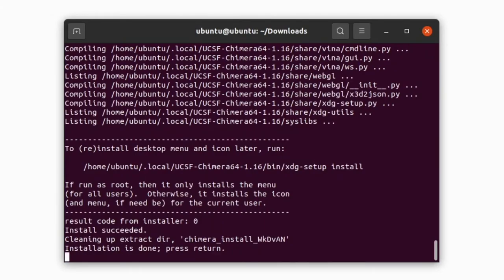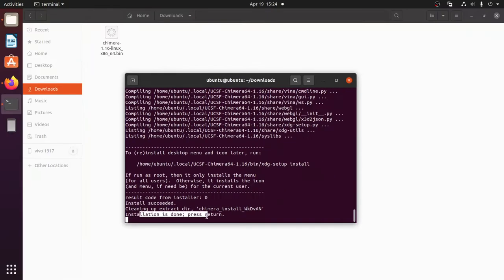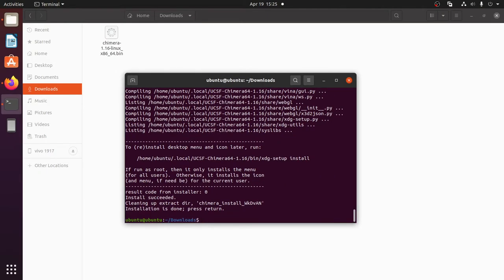Now the installation is successful. You can exit the terminal. Let's go to the desktop.